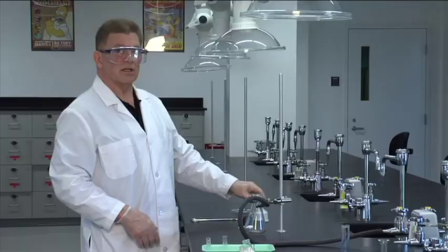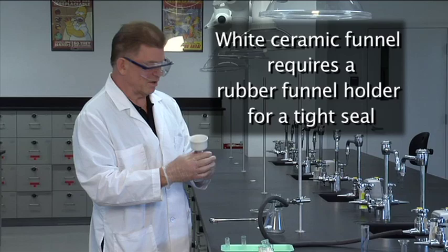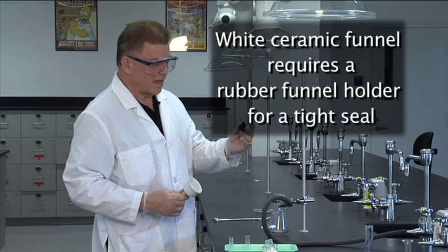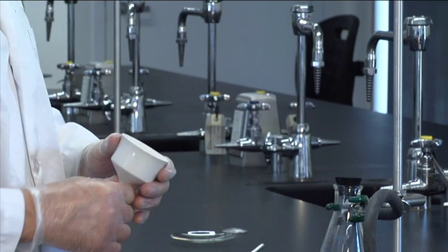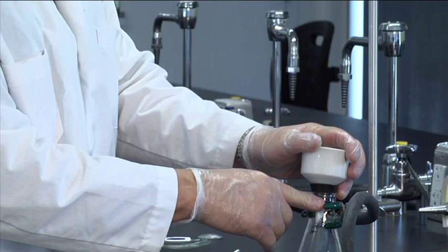Then you're going to need the - this is called a Buchner funnel. This white ceramic funnel is called a Buchner funnel. You need one of those. But in order to make this work with a vacuum you need one of these rubber vacuum adapters. That goes in the top of the flask. And then the Buchner sits on top of that. And then the rubber makes a nice tight, airtight seal so you can pull the vacuum.